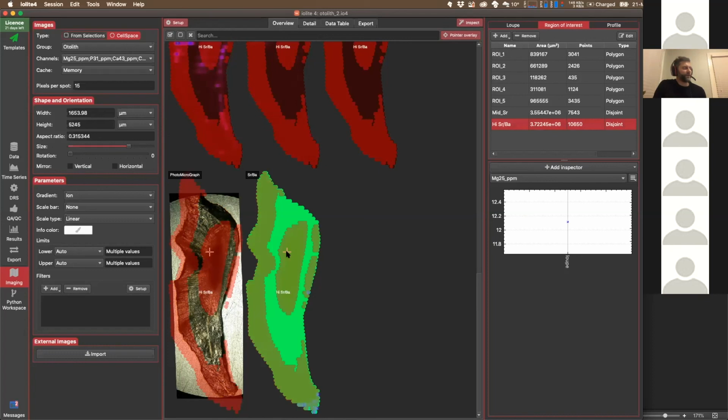I feel like the ECDF would do that to some extent, so it'd be worth having a look to see if it works for you. But if it doesn't, yeah, it's an interesting idea. We'll look into that some more, I think. It's a good idea.